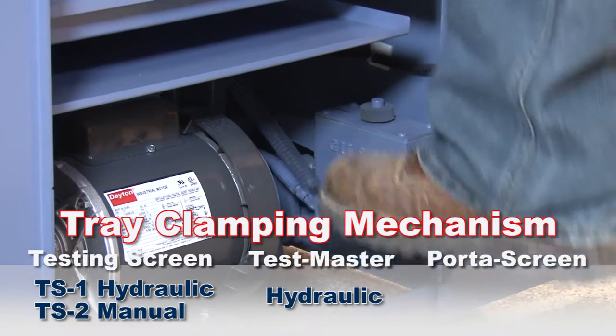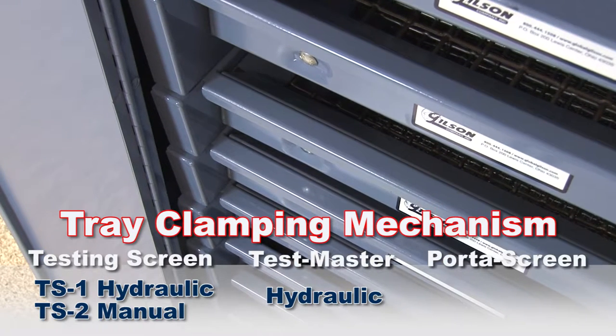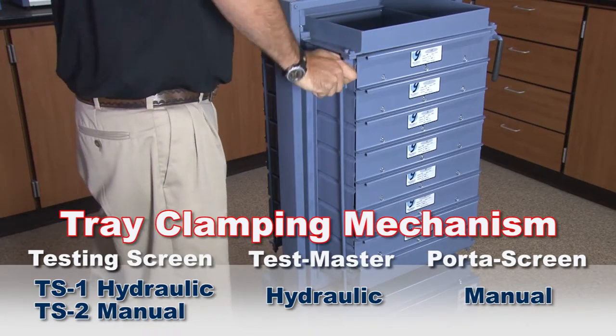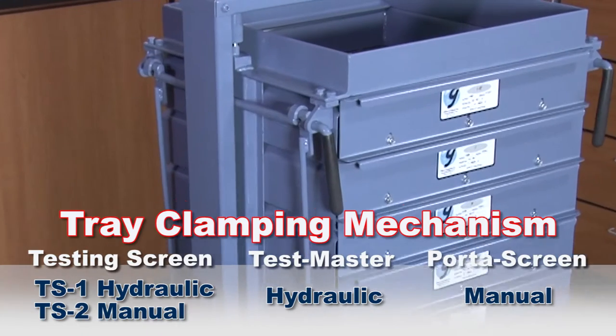The TM5 and TM6 models have a conveniently located foot operated pedal that easily and quickly activates the hydraulic clamping and releasing system. And the PS3 and PS4 screen trays are quickly secured using the easy to use clamp levers.